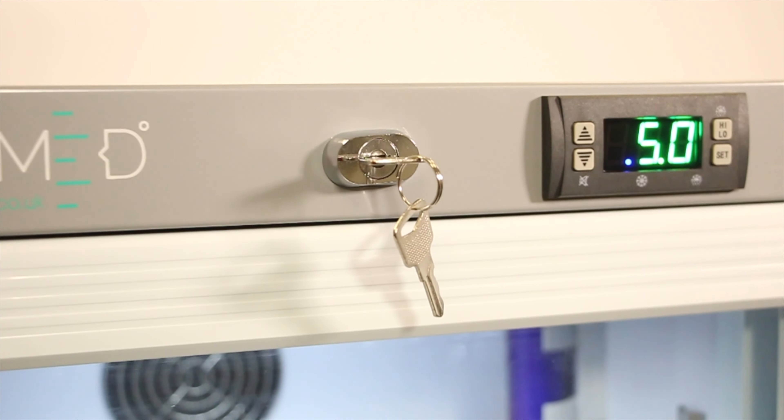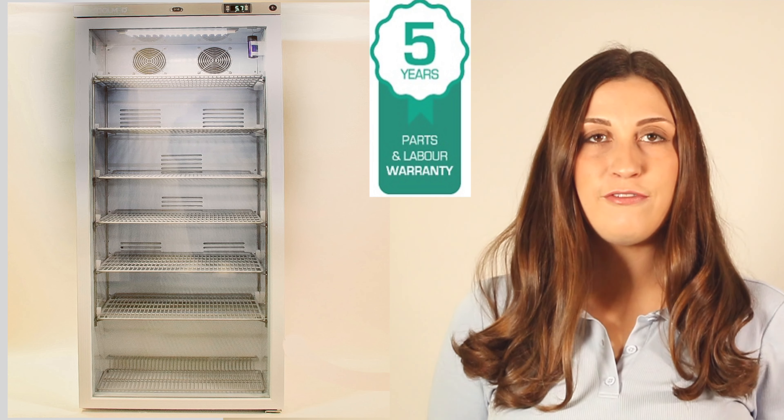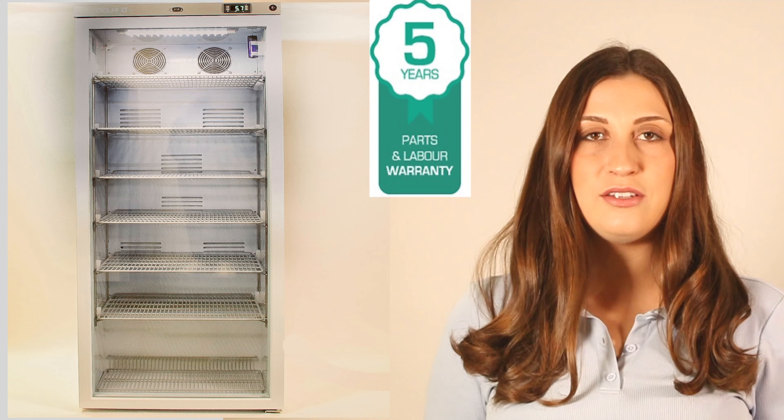Each fridge comes with a lock and two keys to ensure your drugs are kept safe and secure. This product has a five-year warranty with the option to extend to seven years for extra peace of mind.